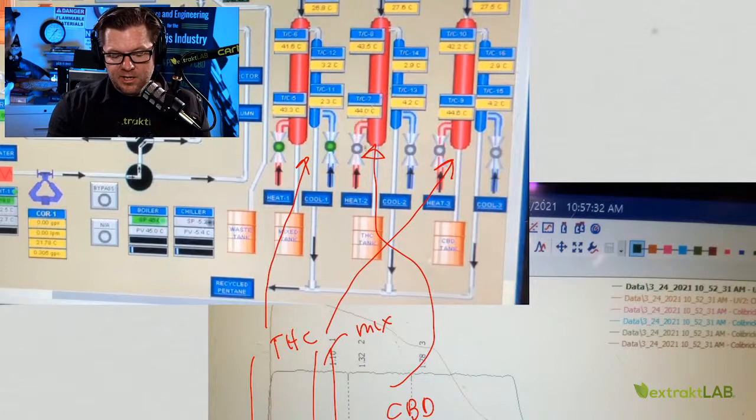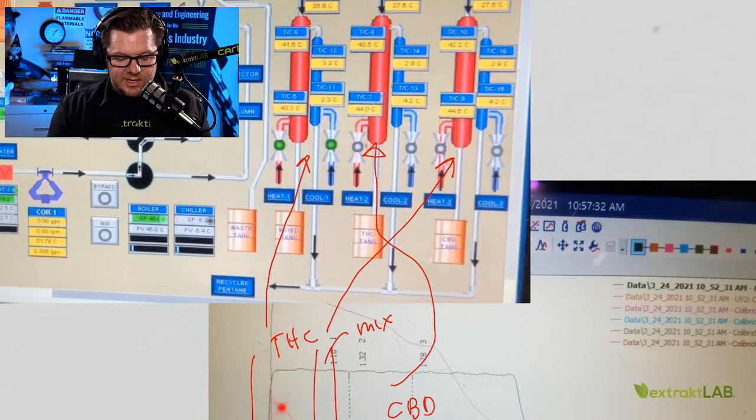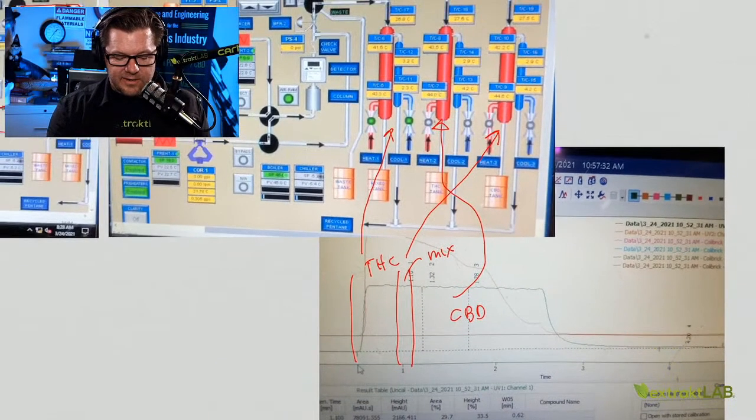And the trick is really knowing when that THC is coming out and when the CBD is coming out. Now, you notice that with a typical analytical chromatogram, what you would see is something that looks like this.